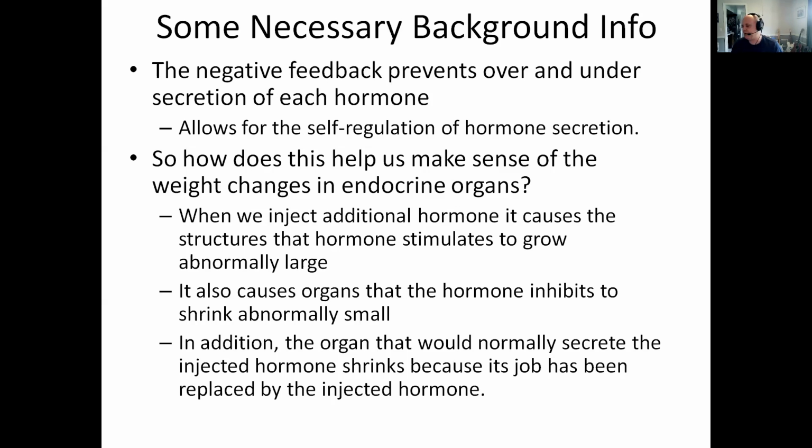Okay, so what does this mean about glandular weight? So if I inject a rat with a hormone, any structures that it stimulates are going to become larger. They're going to gain weight because you're putting them into overdrive by adding additional hormone.